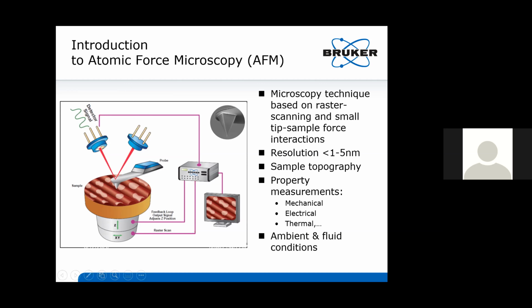Common applications, most people are doing topography. And I'm going to talk a lot about topography because I understand that's a lot of what people in our audience are doing. But there's a lot of other things you can do too. You have really nice AFMs that have many different options on the different tools to look at mechanical or electrical modes. I'll mention those, but I won't get into that too much. And this works in ambient and fluid environments. I'm going to mainly concentrate on ambient, but it works in fluid for biological, electrochemical applications, things like that.